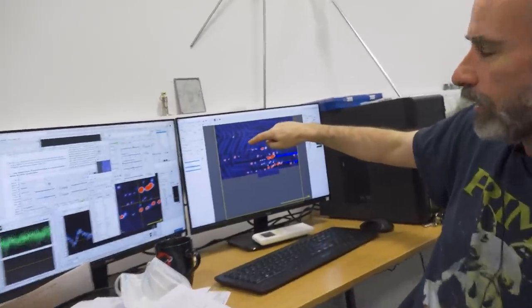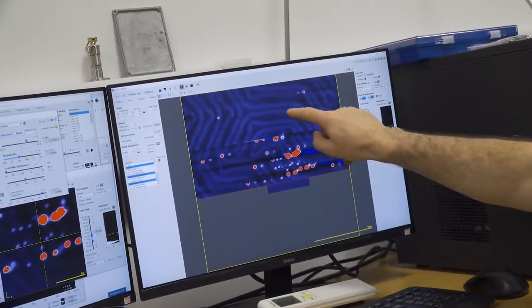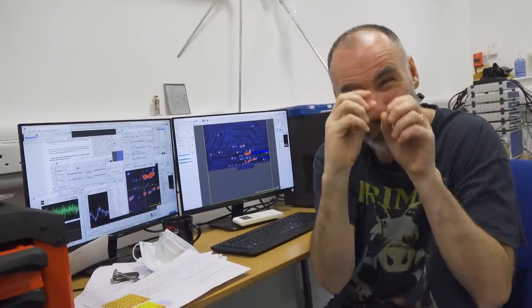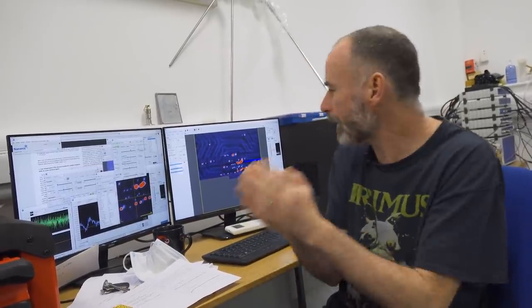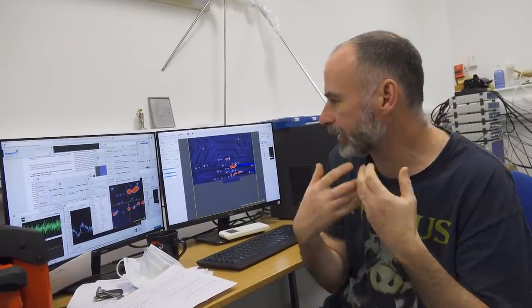This is another famous one. This is called the herringbone reconstruction of gold. What you have here is these larger or these brighter regions. There's effectively a rumpling in the surface so that some atoms move up, some atoms move down. It's a very, very small rumpling. And again, they're doing that to try to relieve the strain, to try to bring their energy back down. And this reconstruction is very famous in terms of, it's a very stringent test of the stability of a microscope and the resolving power of the microscope in terms of, can you resolve that herringbone? Can you see that without a great deal of noise?